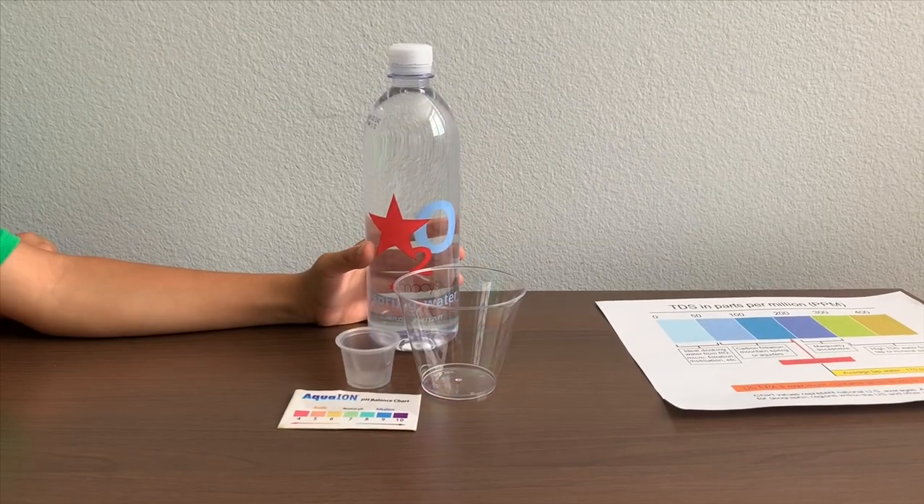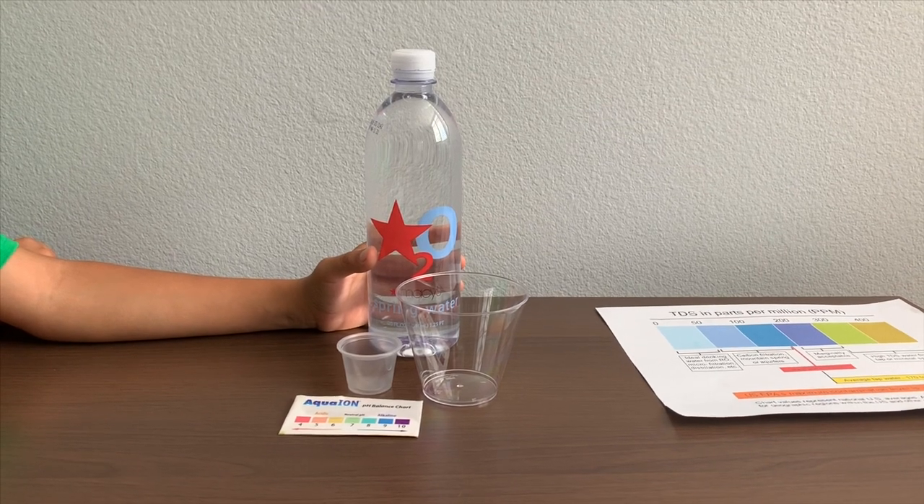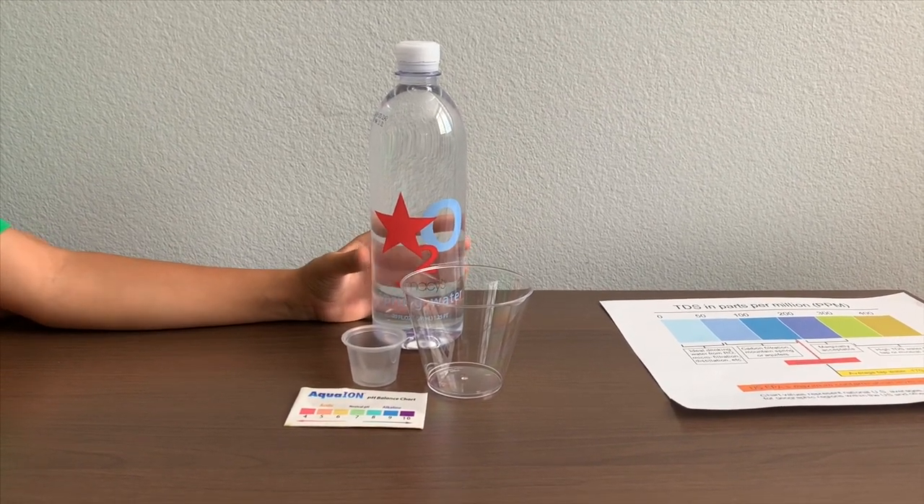This is Macy's spring water sourced from Palomar Mountains, California. It costs $3.99. Let's test the pH and TDS levels.